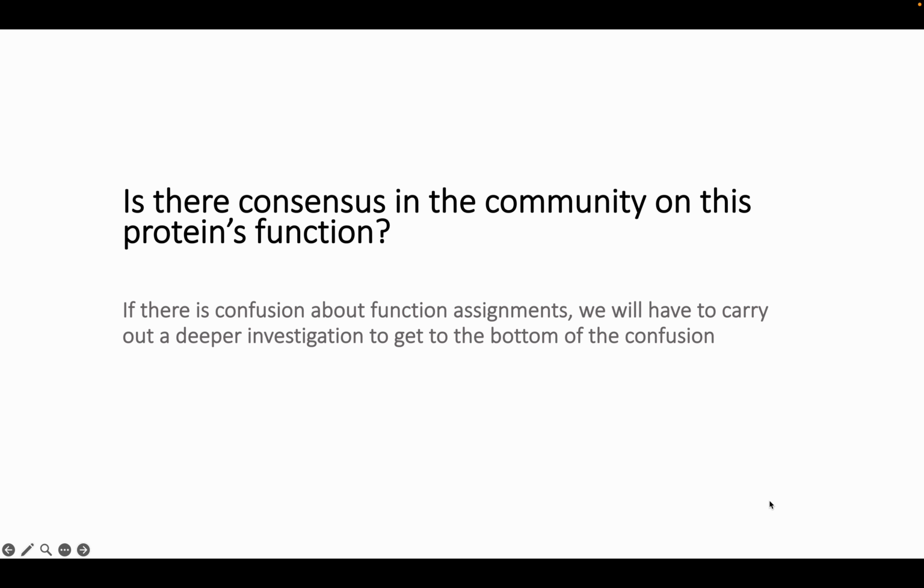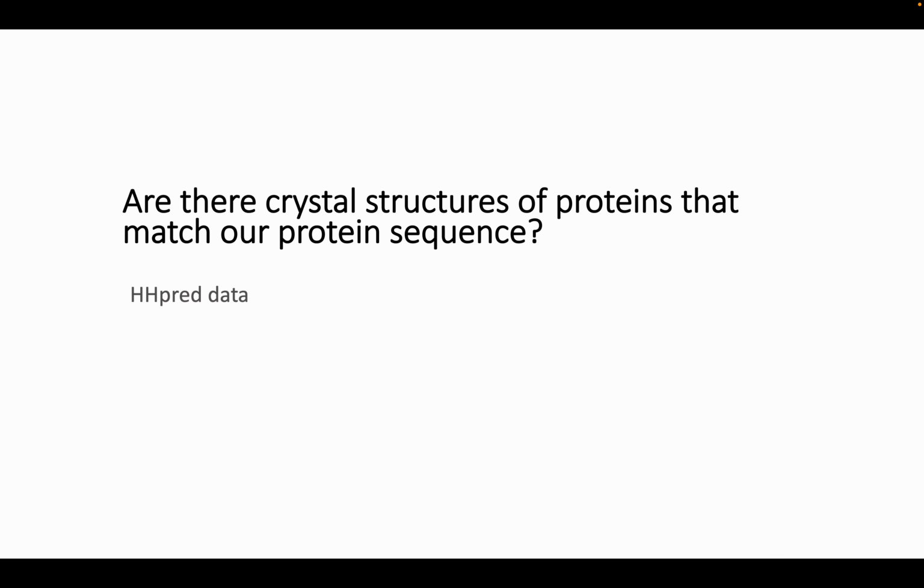Okay, in this video, it's the wrong screen, we are going to learn about how to interpret HH-Pred data in the Pecan output and capture those notes and interpretations in our electronic notebook and Pecan notes.